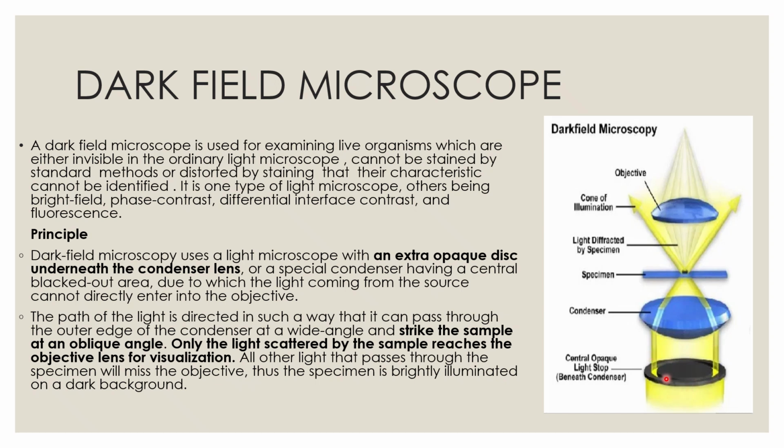Now this small amount of light which passed through the unblocked region reaches the condenser. The condenser works similar to our bright field microscope. Again from the condenser the light hits onto the specimen. The specimen is over here. We all know that the refractive index will vary based on the components. Different components will have different refractive indices. The same thing applies over here.